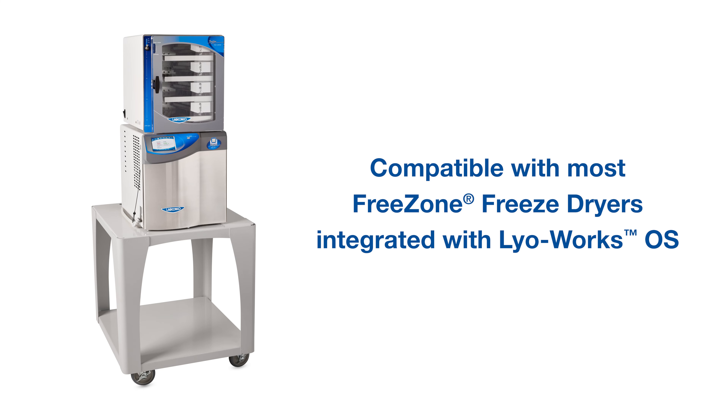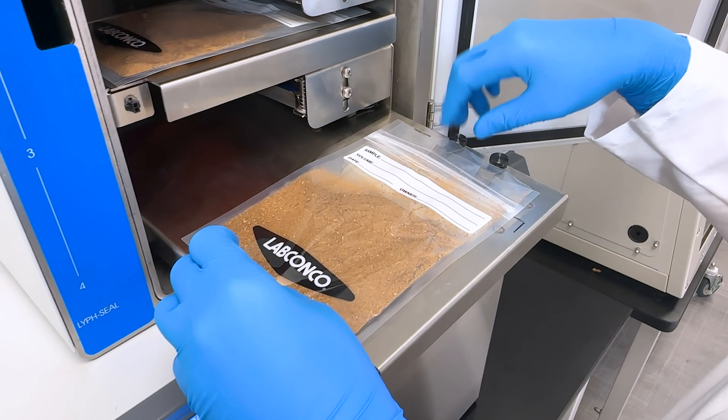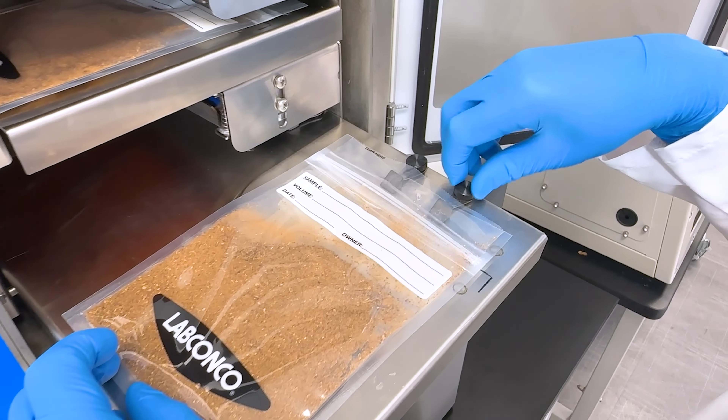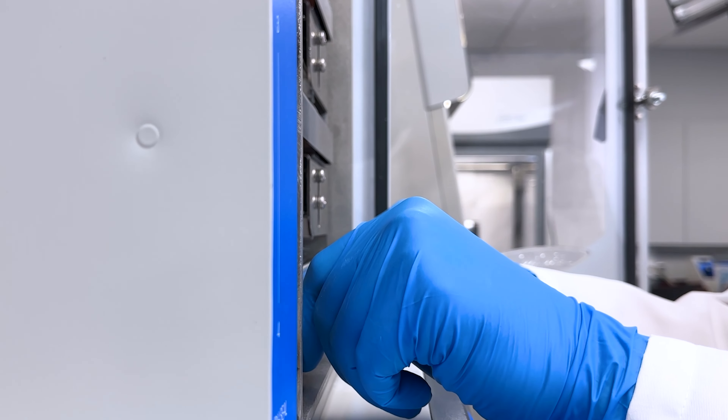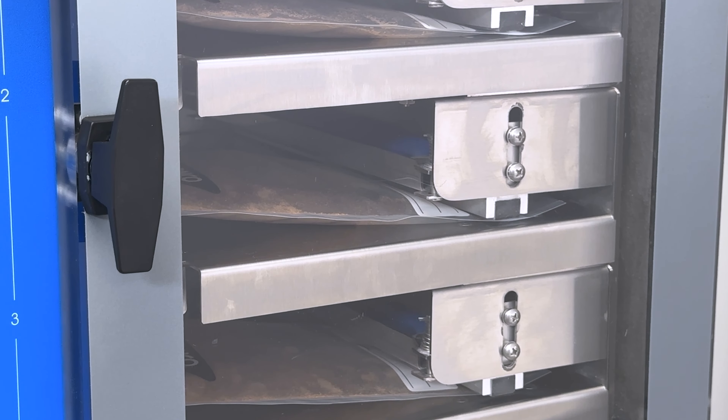Compatible with a wide range of FreeZone freeze dryers, the LifeSeal is equipped with four processing shelves, each capable of holding multiple bags for simultaneous batch processing. Bulk up your lab's capabilities without compromising sample integrity.